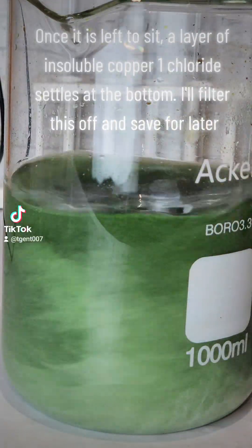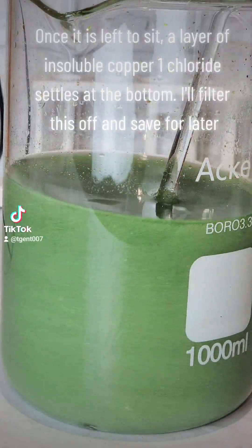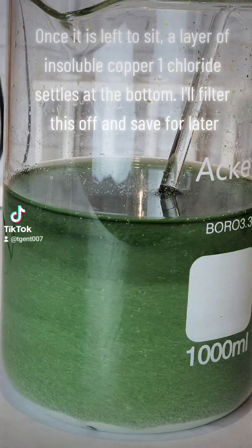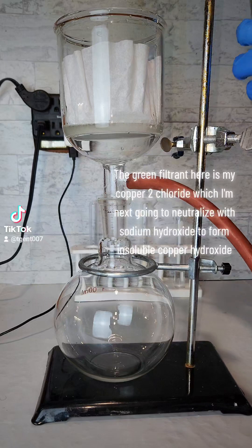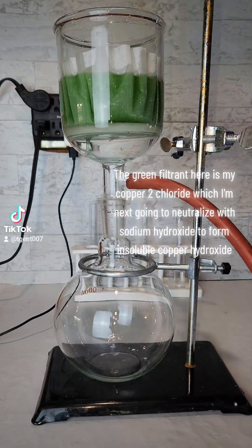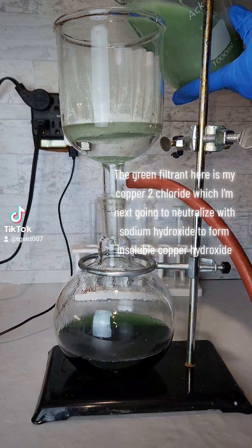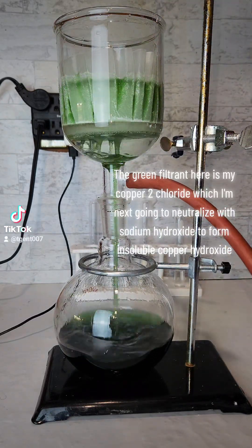Once it is left to sit, a layer of insoluble copper chloride settles at the bottom. I'll filter this off and save for later. The green filtrate here is my copper(II) chloride, which I'm next going to neutralize with sodium hydroxide to form insoluble copper hydroxide.